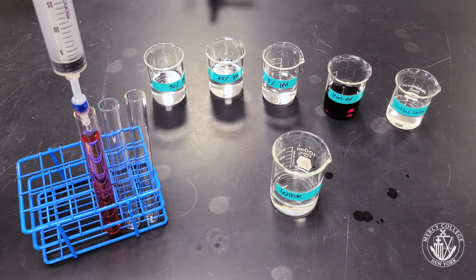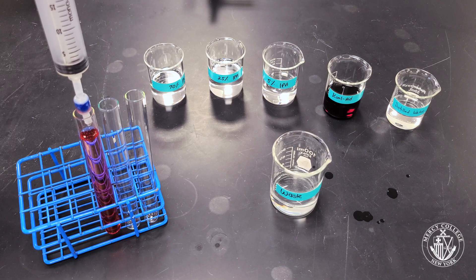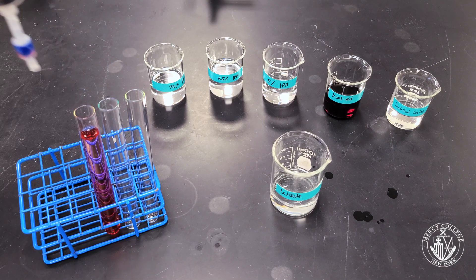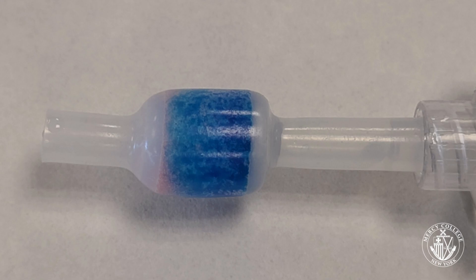Continue to collect the elutant until you've fully removed the red dye from the column. A successful separation will leave only blue dye remaining on the column.